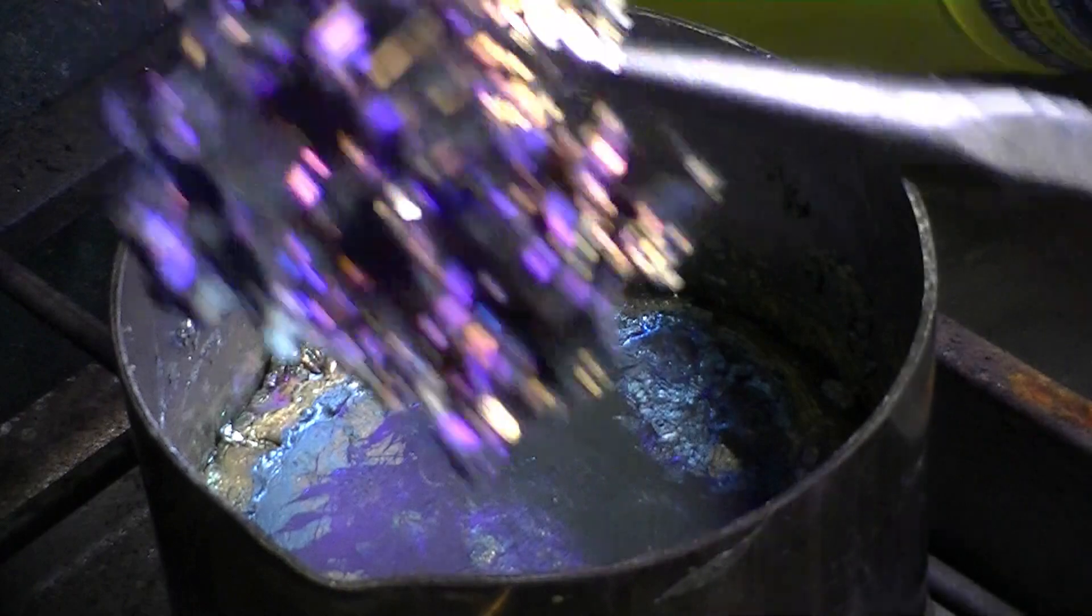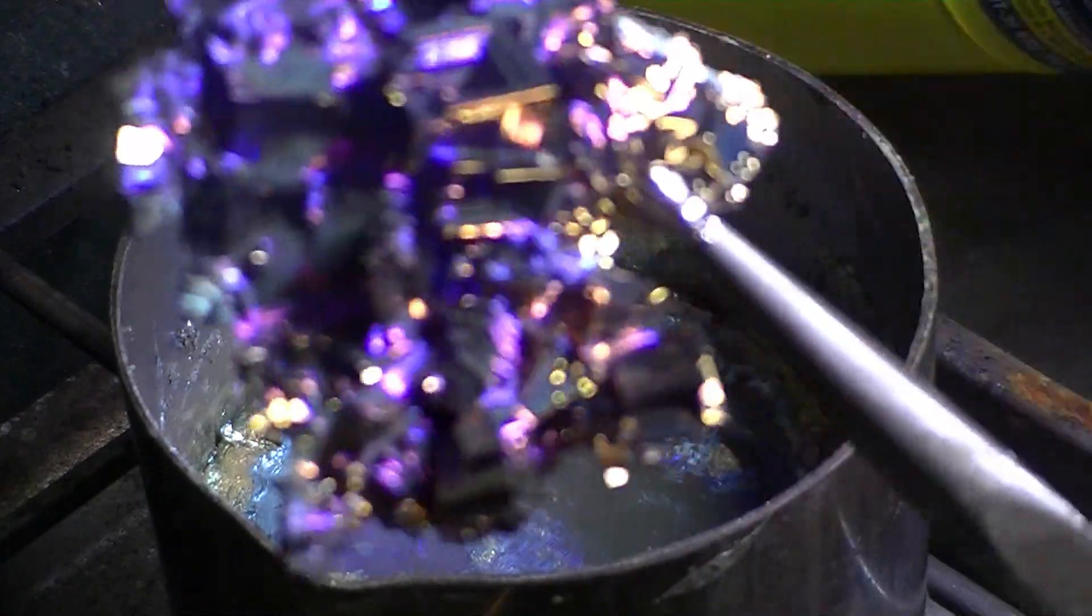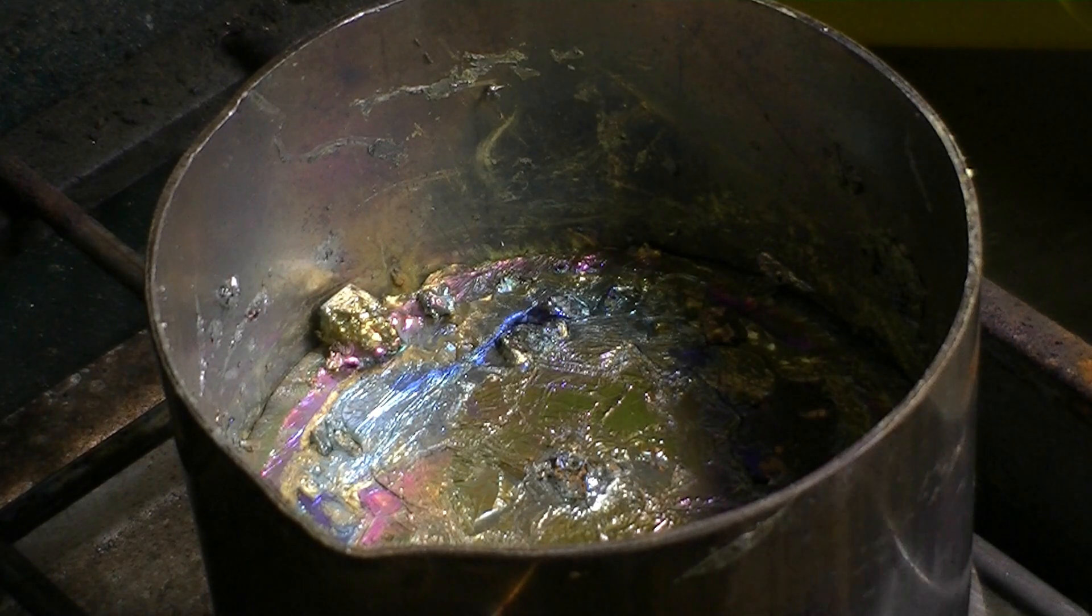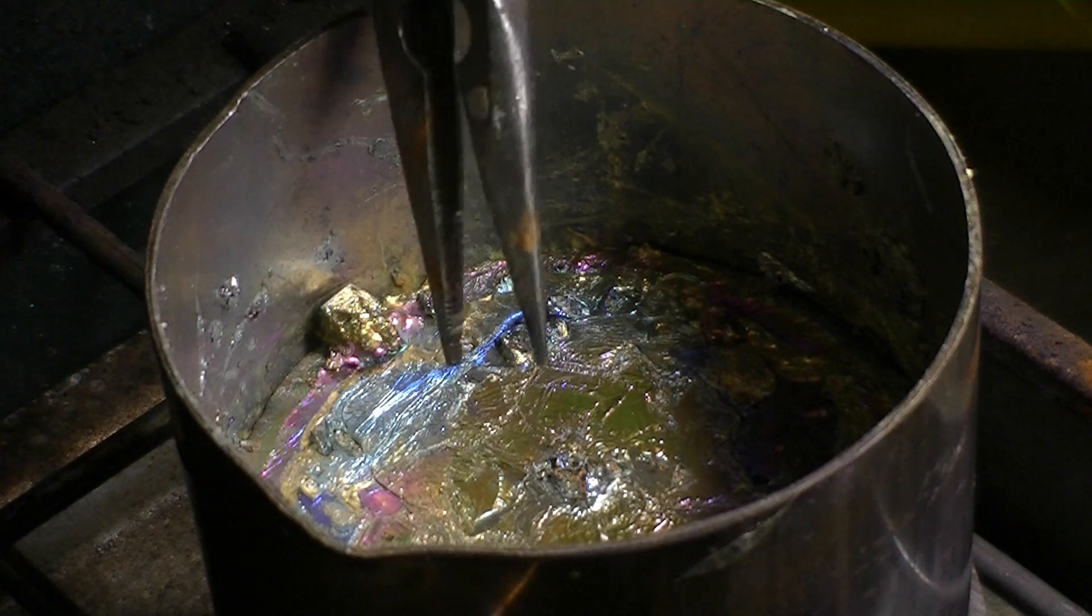The metal slowly tarnishes in air to give that purpley appearance. And with the metal so close to its melting point, it is very easy to remelt and pull another crystal.